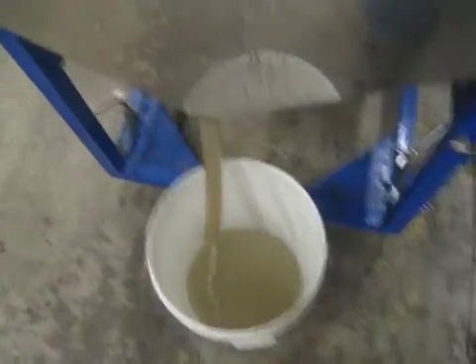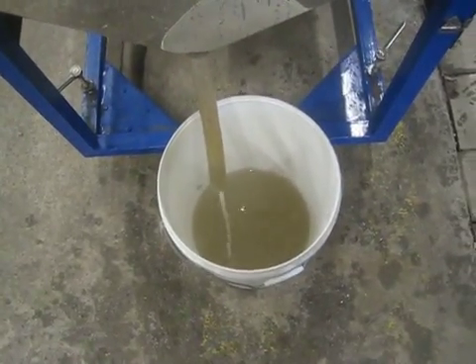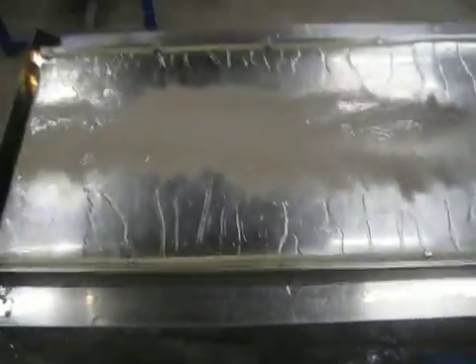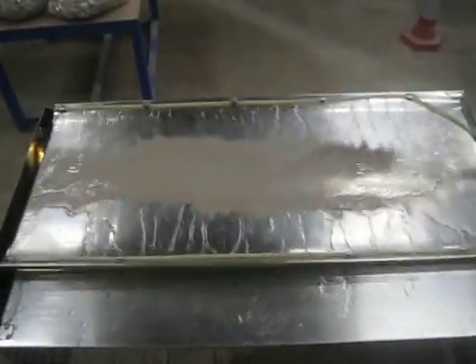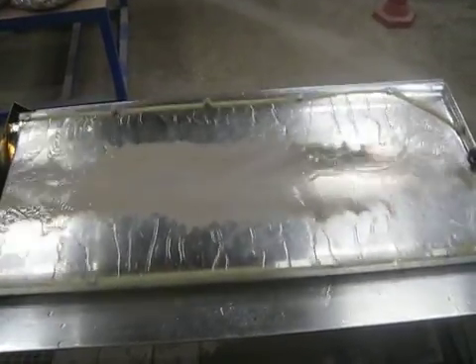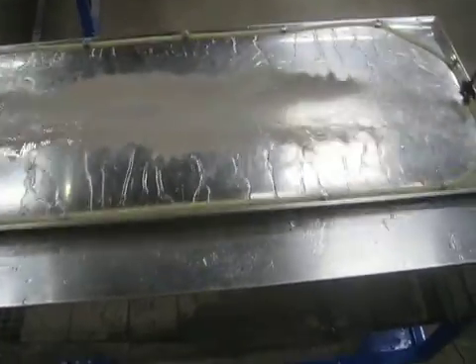The first material to leave the deck are the lighter particles. The end of the test.